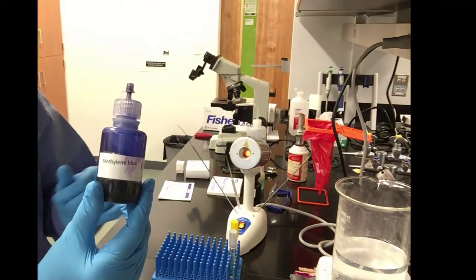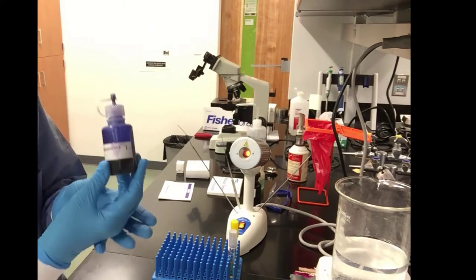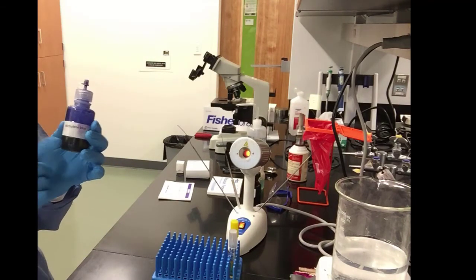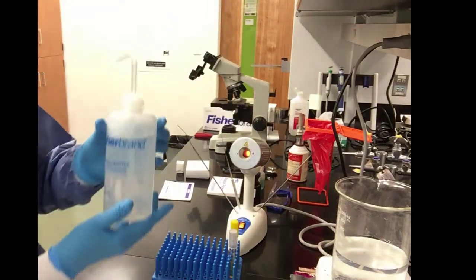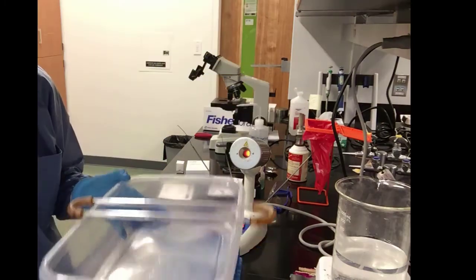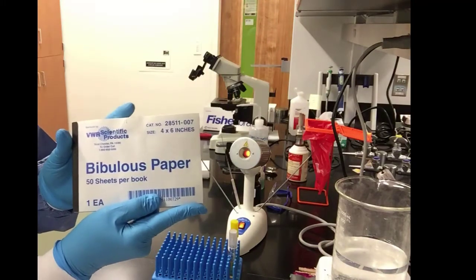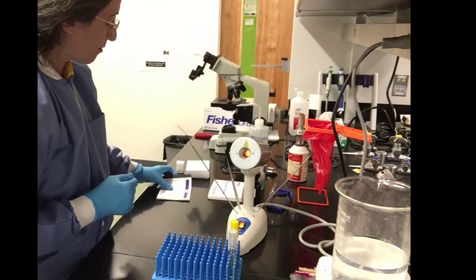We will use methylene blue. This is the counterstain. Any bacteria that are not Acid-Fast positive, that don't have mycolic acids, will pick up the blue stain and will decolorize with the acid alcohol, whereas the Acid-Fast positive will pick up the carbolfuchsin and will not decolorize. We also will use some distilled water for our washings during the staining procedure. We have our nice Tupperware where we can collect all the stains during the staining procedure. We also have bibulous paper that we will use to dry our slides after the staining. We place them between these pages and dry them.